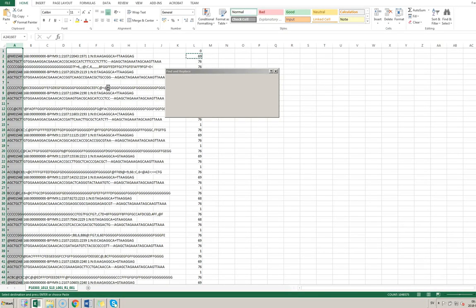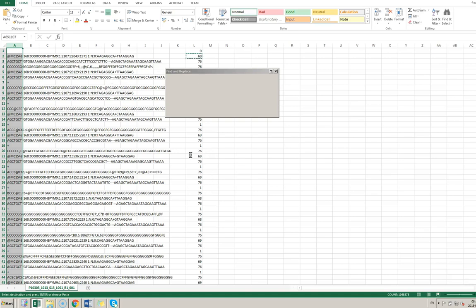This is going on — it's a big file so it takes a very long time, which is what you'd expect. The guide RNA sequence starts with CACCG in our plasmid (lentiGuide-puro). Later I'm going to replace CACCG as well. In essence, what I'm trying to do is change the read sequence so that the length becomes predictable, so we can sort out the guide RNA sequences from the rest.